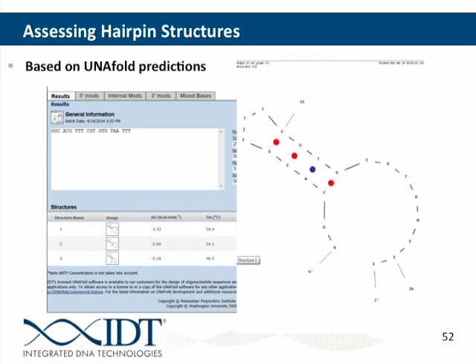So here's an example where it's got a relatively high Tm. We put a loose cutoff at 40 degrees. Anything over 40 degrees we want to look at more carefully and consider whether or not that's going to be a problem for our reaction. However, that Tm can often be an overestimate when you have just a few bases that are matching. Here we only have a stem of 4 bases, so this is most likely an overestimate.